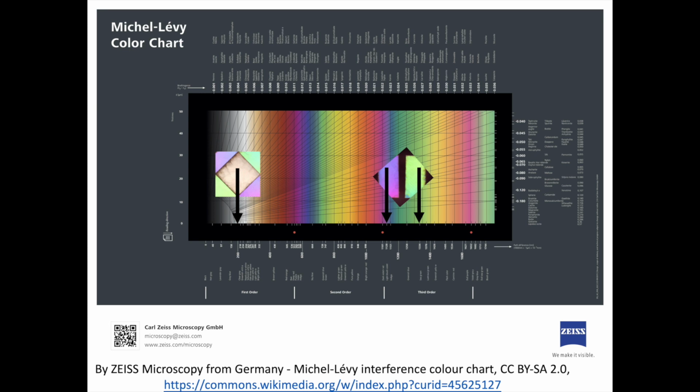Let's now figure out what happens when we have our plates oriented parallel to one another. When we place our oriented Muscovite plates parallel with one another, our refractive indices align for our plates. Gamma is aligned with gamma and alpha prime with alpha prime. And so in this instance, our interference colors and path differences will actually add with one another. You can sort of think of this as we just have a much thicker mica sheet.